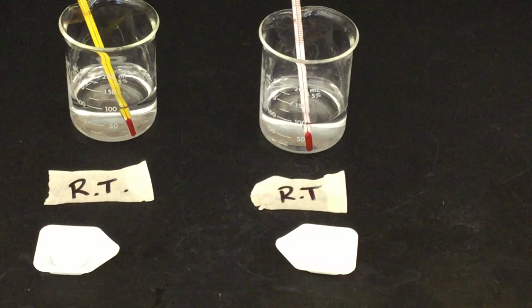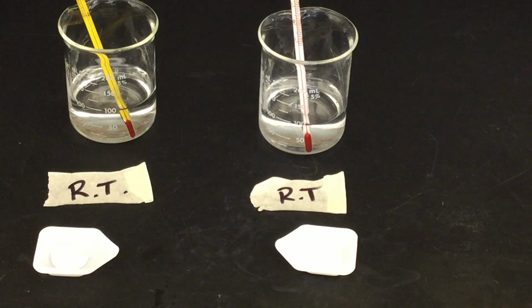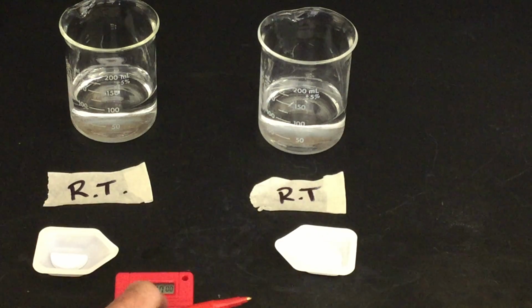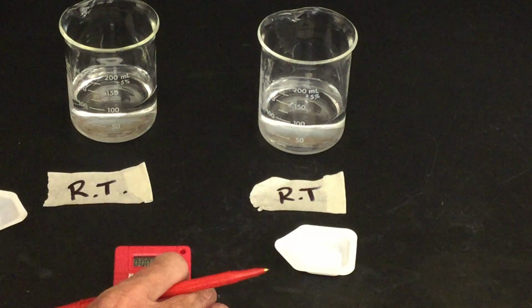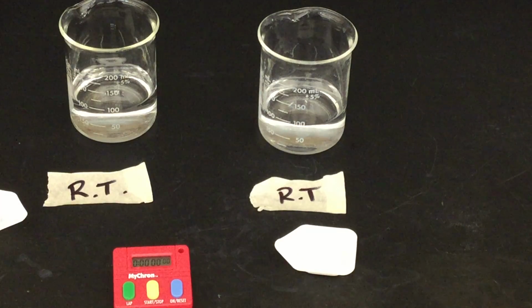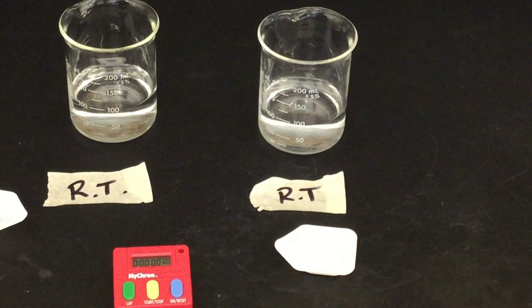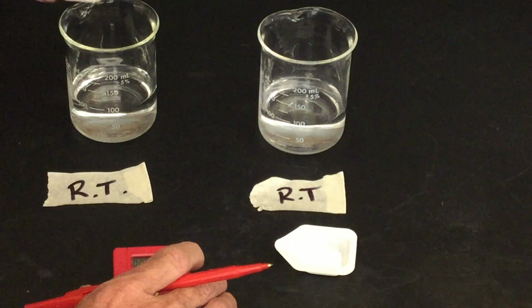Well, let's now compare these two. They're both at room temperature, and I'm going to take the thermometers out. Getting the timer going, so what's the time of this going to be? Well, the temperature of this is in between the hot and the cold, so the time should be somewhere in between the hot and the cold. So we'll go ahead and drop this in.